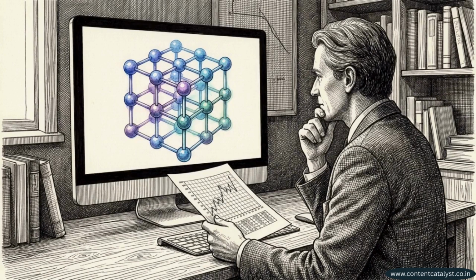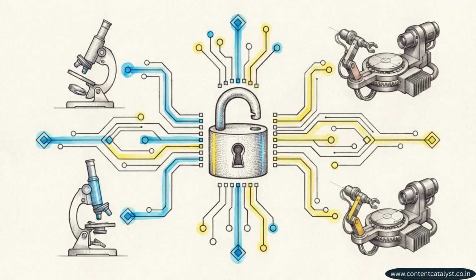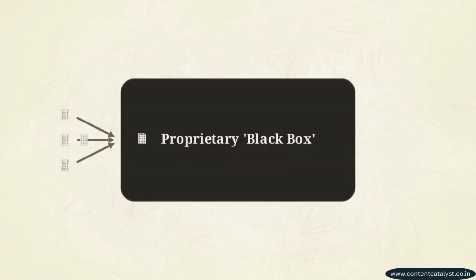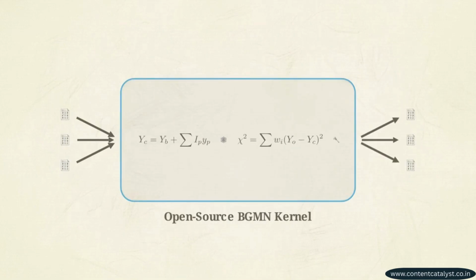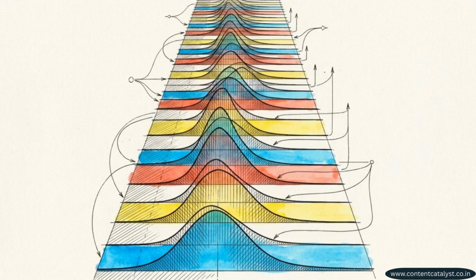That is precisely why the open-source architecture of tools like Profex is critical for the future of materials research. It removes financial barriers for smaller labs while providing total, uncompromised transparency into exactly how every mathematical parameter is handled behind the scenes. As multi-scan experiments scale up in complexity, the workflows used to analyze them must be entirely traceable.